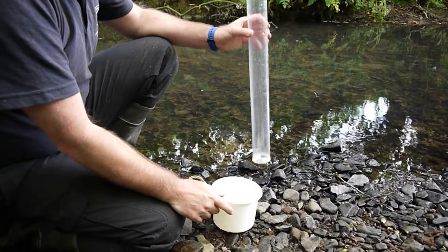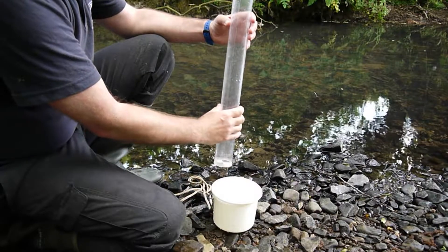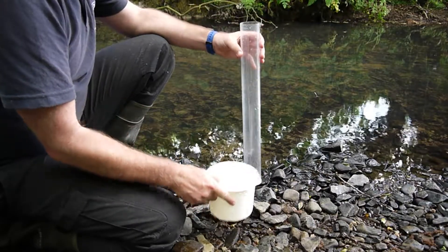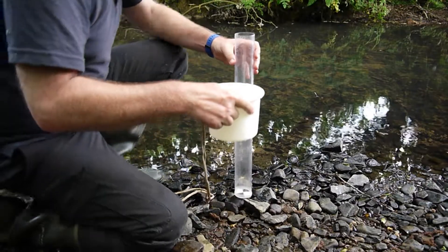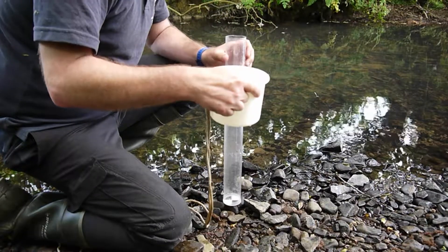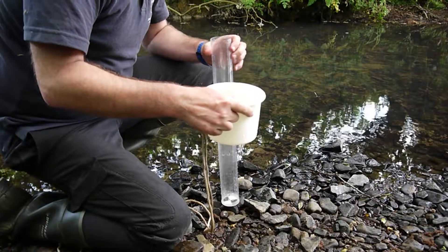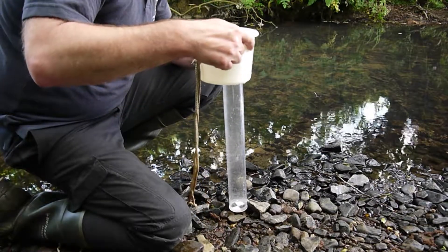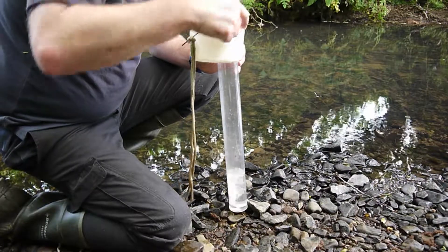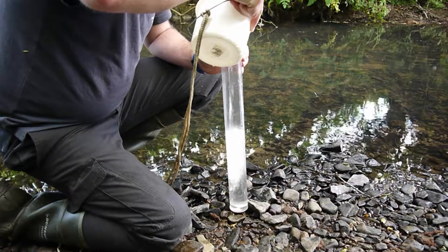We're going to run through the water quality testing elements now. I've got my sample from the river and the first thing we do is the turbidity test. It takes just over a litre to fill this, so with a one and a half litre bucket we should be able to fill it if we need to. Make sure you have the tube in your shadow so the sun isn't directly on it, then you can pour the water slowly into the tube.